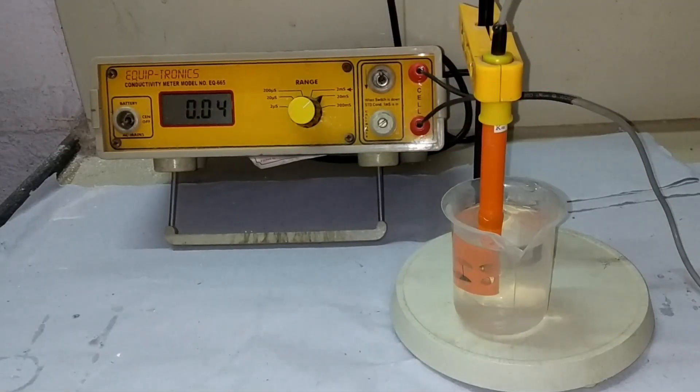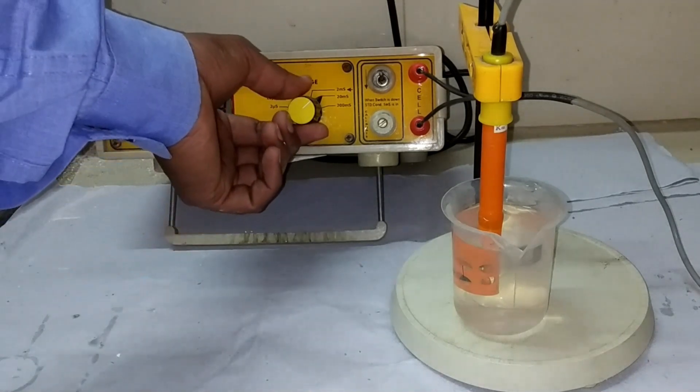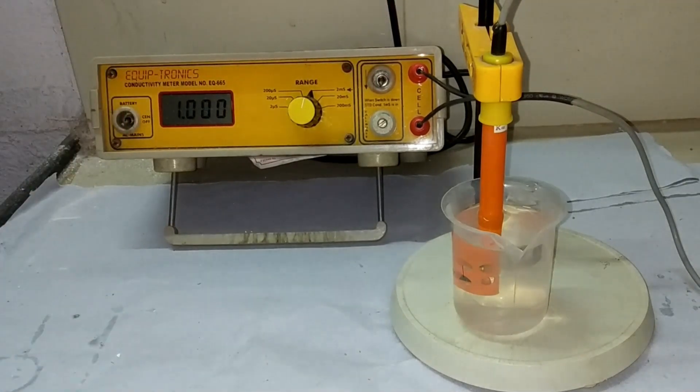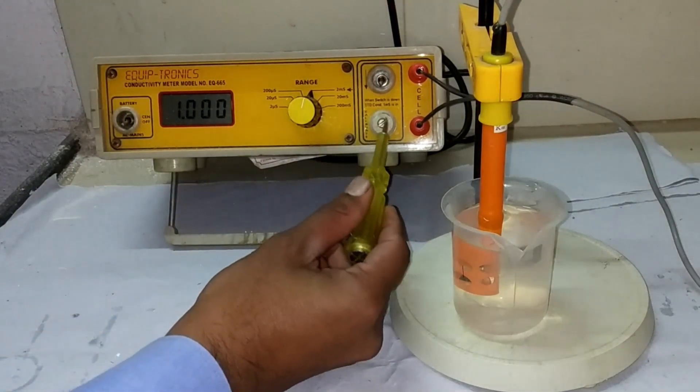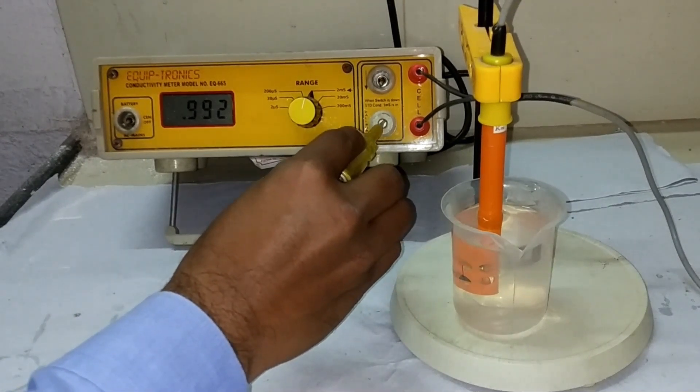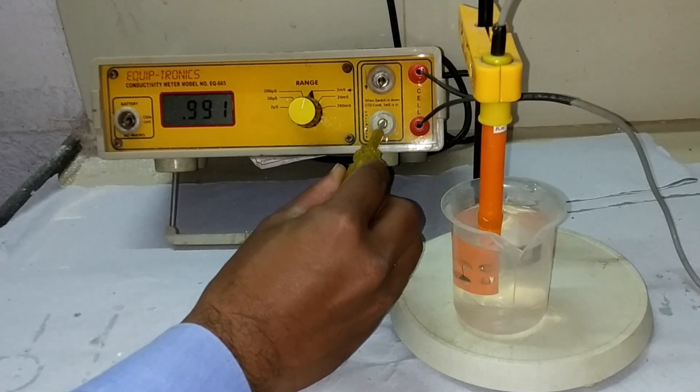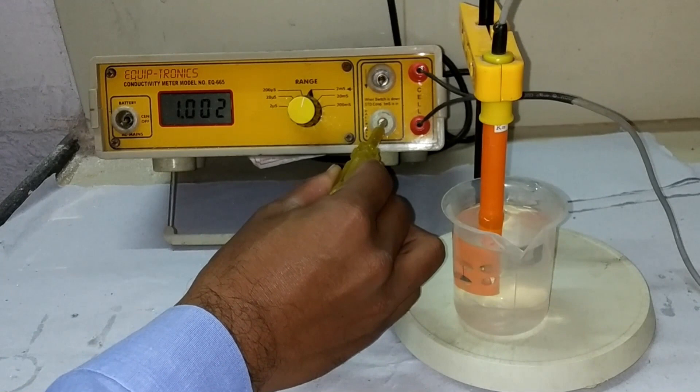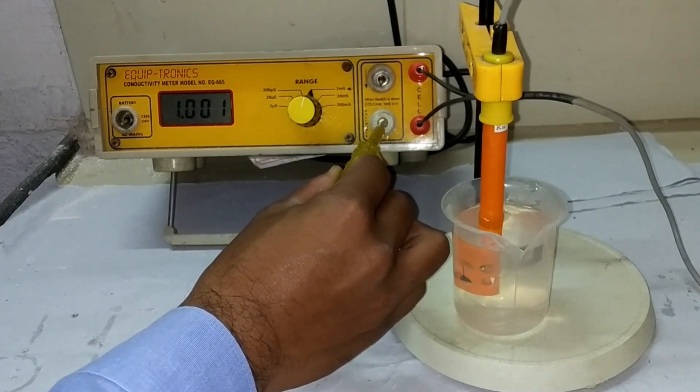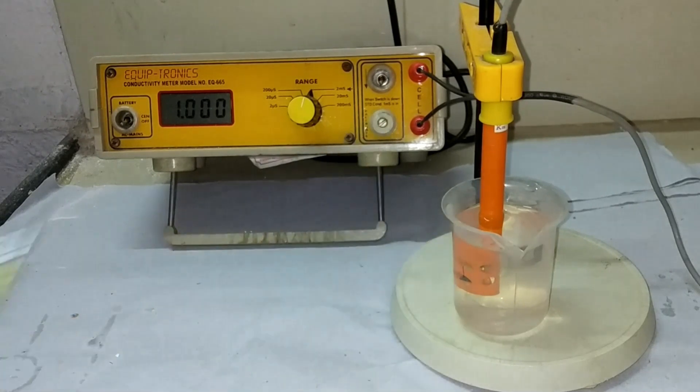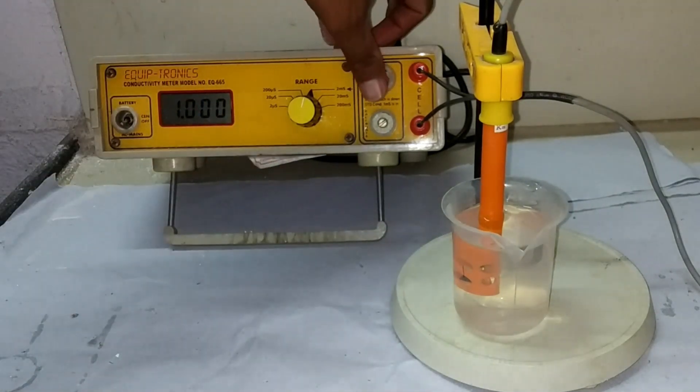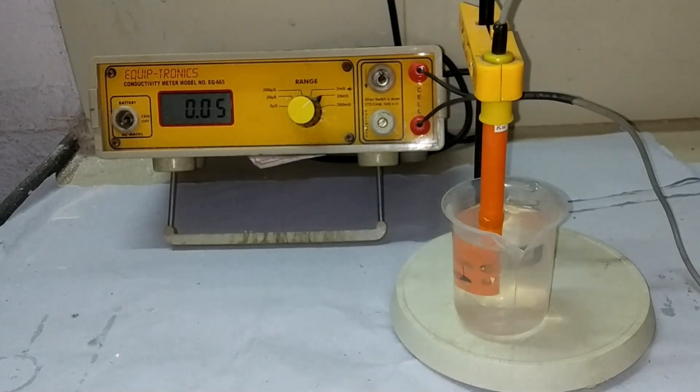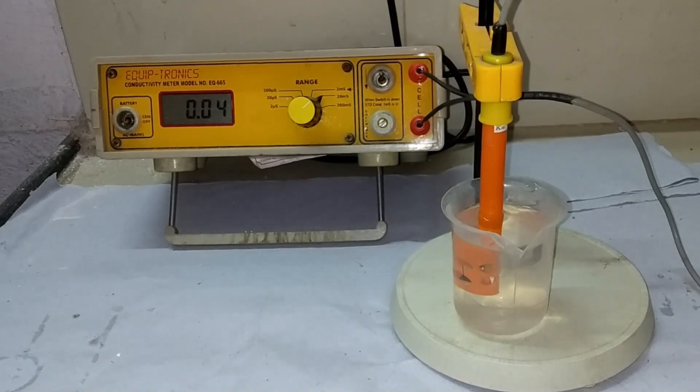Shift the Range Knob from 20 millisiemens to 2 millisiemens. Shift down the Standardization Knob, then adjust the display reading to 1.000 using the calibration knob. Shift the Standardization Knob to Up. Shift back the Range Knob from 2 millisiemens to 20 millisiemens. Now the Digital Conductivity Meter is ready for experiment.